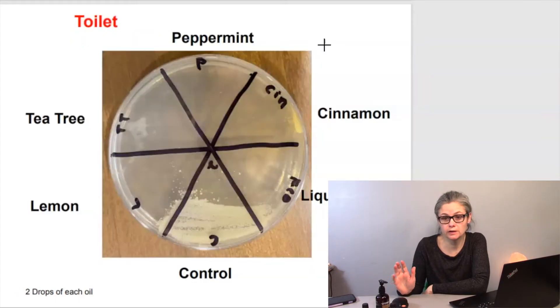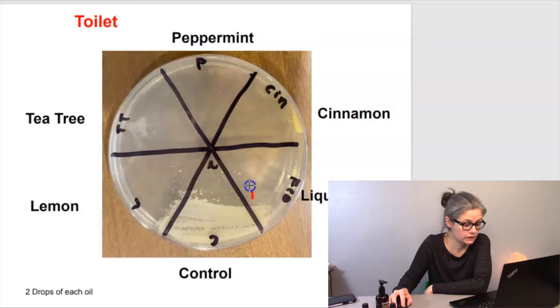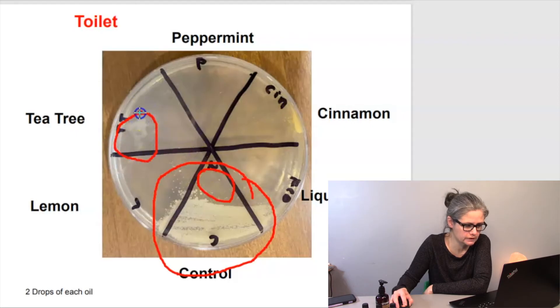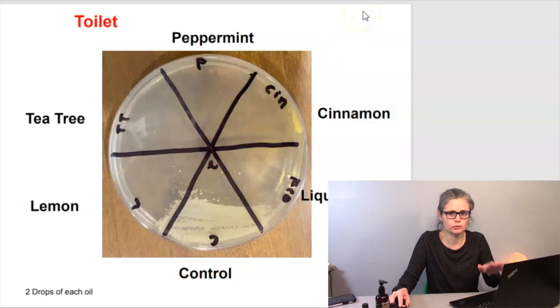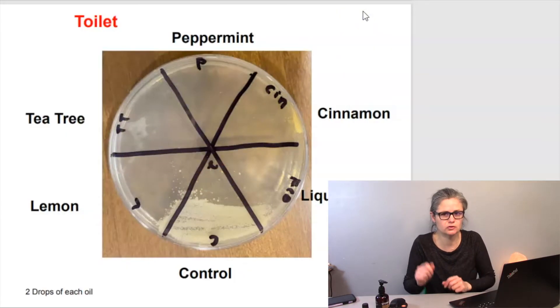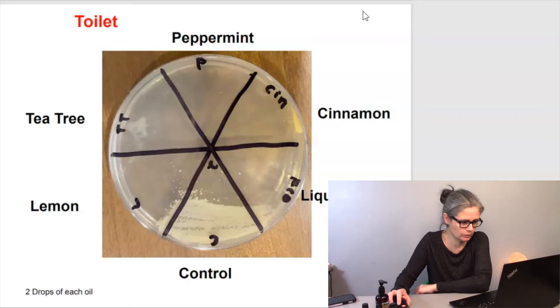Next, let's look at the swab from the toilet. So you can see here from the control, there is definite growth, but it stops here. So I'm not really certain what happened here. Then there's also a very strange looking, maybe a mold growing here on the tea tree oil section. Nothing in peppermint, nothing in cinnamon, nothing in liquid coconut. So I decided to redo this test and just continue to use just the sink bacteria. Let me show you what I did.